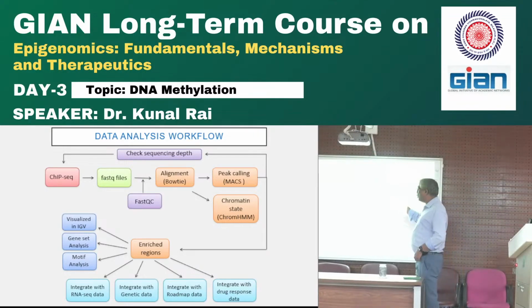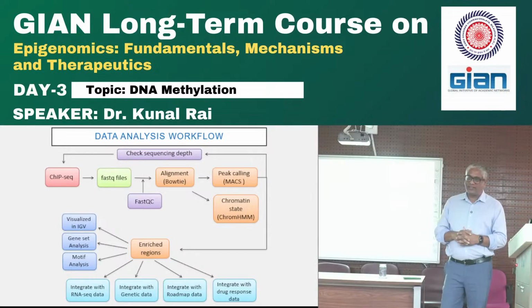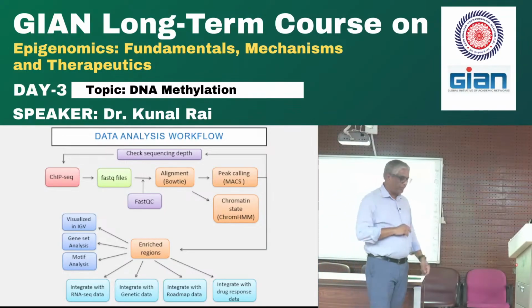So it's a tool called Bowtie, okay? What a lovely name. You should go look into it. They use BWA, which is based on the Burrows-Wheeler algorithm. BWA is probably what's used more these days.